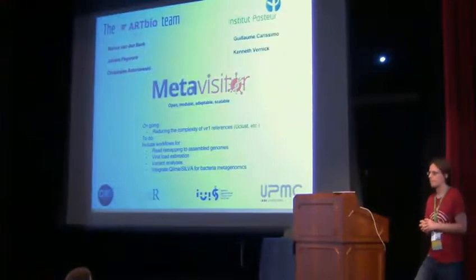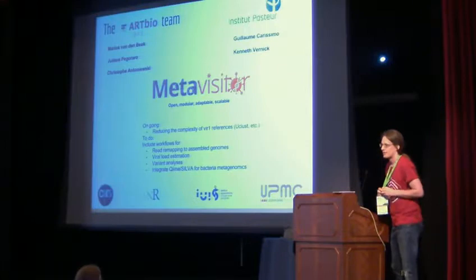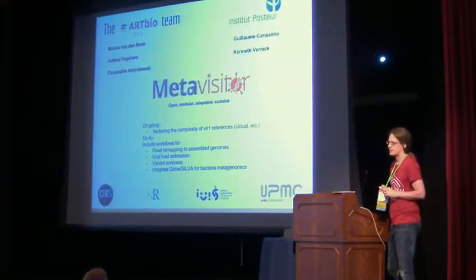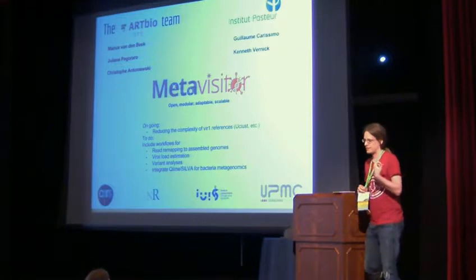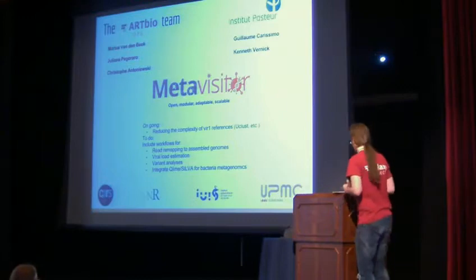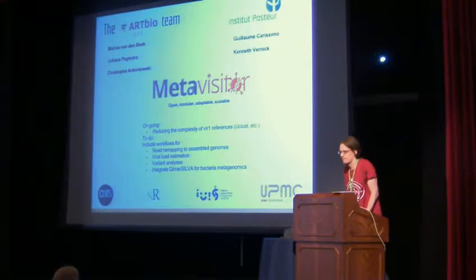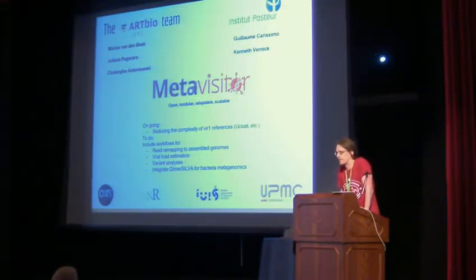I was looking at the workflow that you had put up there, and it looked like you were mostly pulling RNA-seq data, because I saw the Trinity and Oases step. So how is that collected? I was asking about the workflow that you showed. You were mapping it against known references first and also doing a de novo step. So I was wondering how that relates to the raw data you were collecting. Were you collecting RNA?